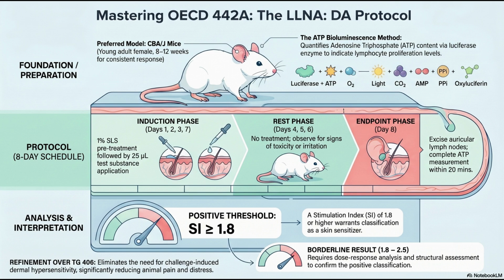Right. A tester might assume that, well, if a chemical is water-soluble, I should naturally dissolve it in 100% water for the application. But the mouse's ear is covered in sebum and natural oils. Exactly. If you pipette pure water onto it, the surface tension just causes it to bead up and roll right off. Oh. The chemical never interfaces with the stratum corneum at all. Exactly. It just runs down the mouse's face. The guideline expressly forbids wholly aqueous vehicles for this reason.